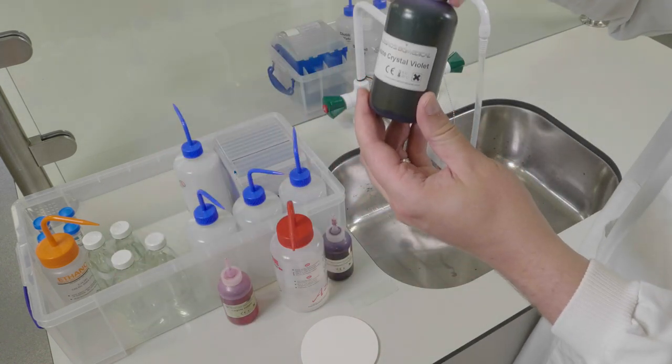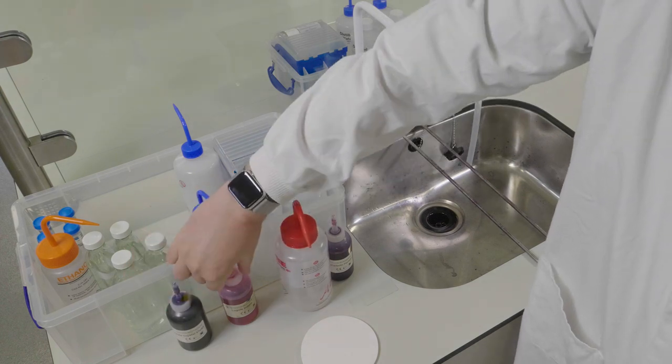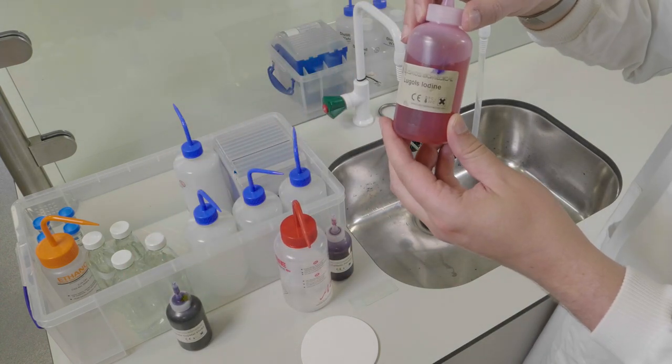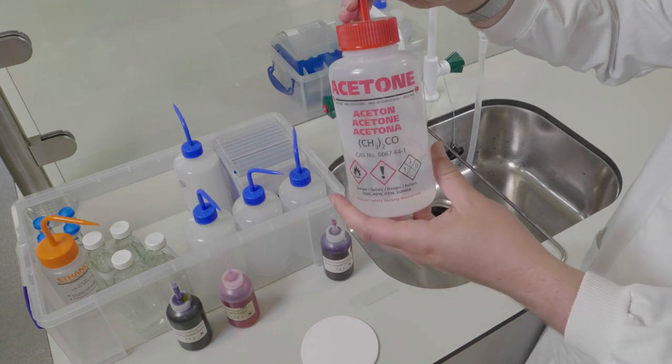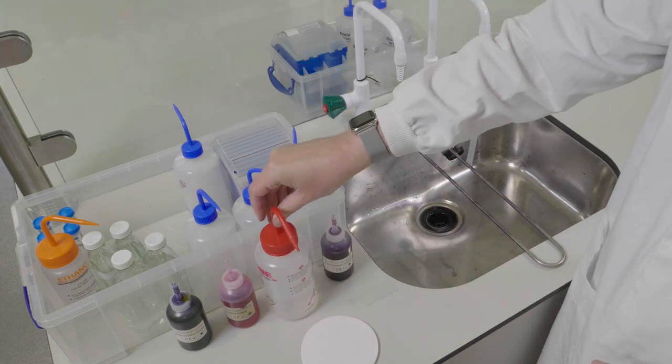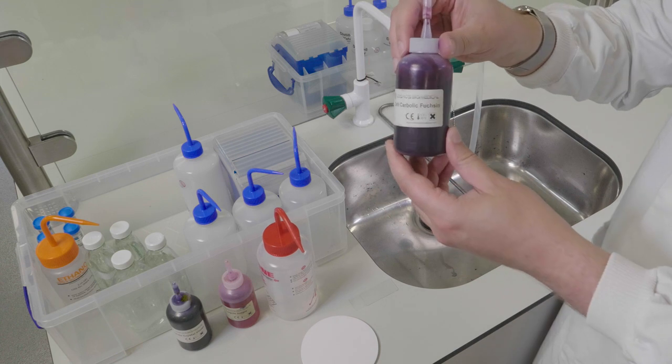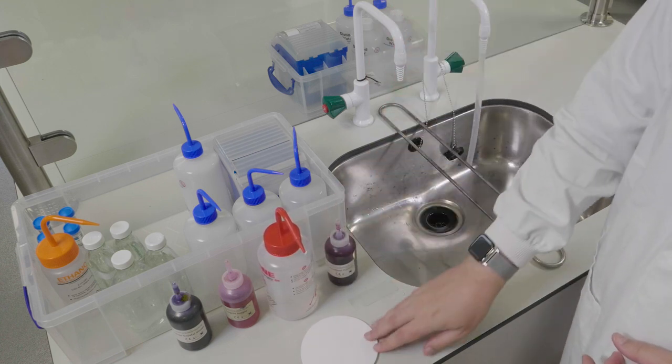From the box by the sink, take out the crystal violet, Lugol's iodine, acetone and some carbol fuchsin. You also need to collect some blotting paper.